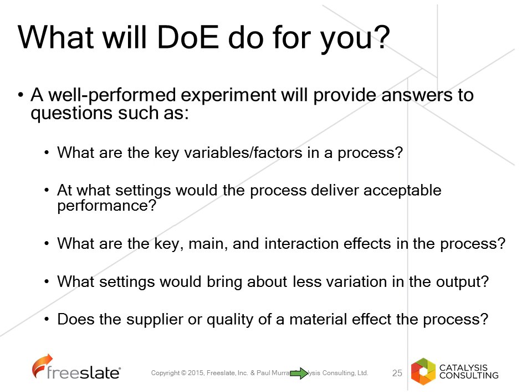If you carry out an experimental design properly, it will tell you a lot of useful information. It will help you to understand what factors or variables are important in your process. So is that what temperature, what solvent to run, what concentration, how much base, how long the reaction will take. It will also help you to work out at what settings for those key factors you will get the best performance for your process.